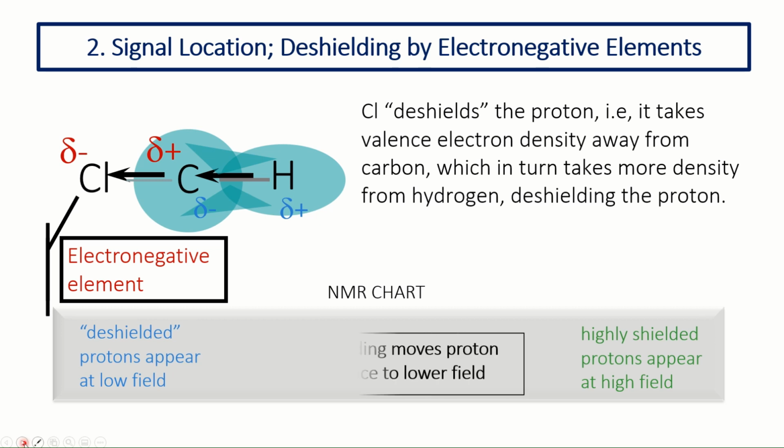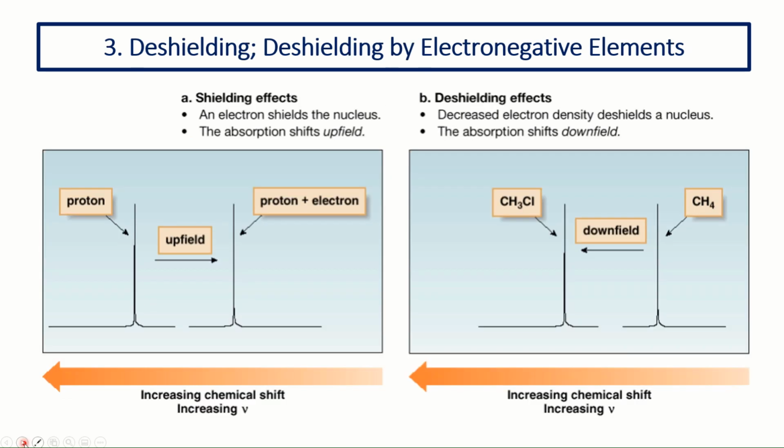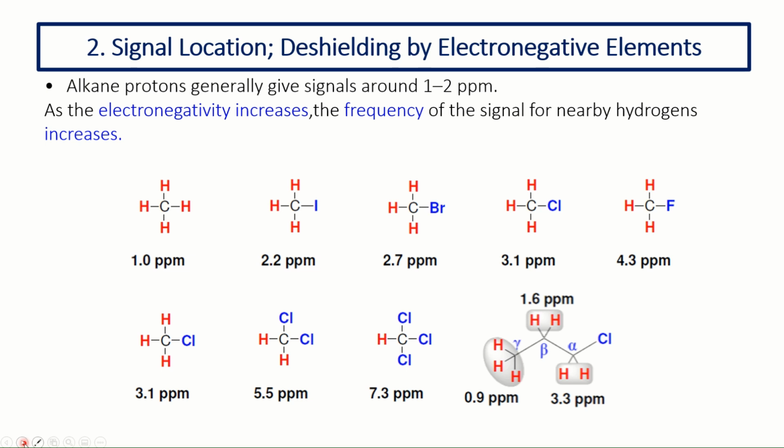And so what we would end up having, therefore, is the signal of this proton will appear further downfield. You can see this is an inductive effect, of course.